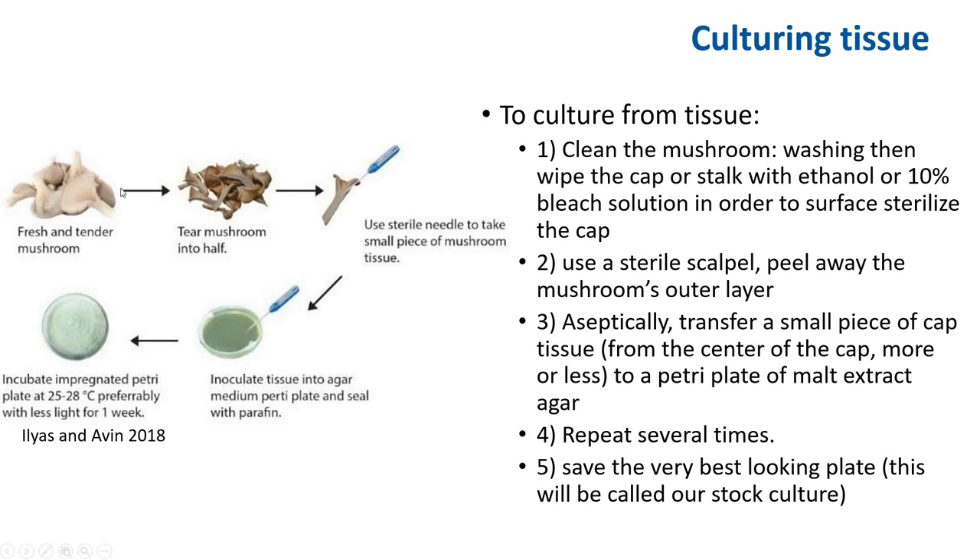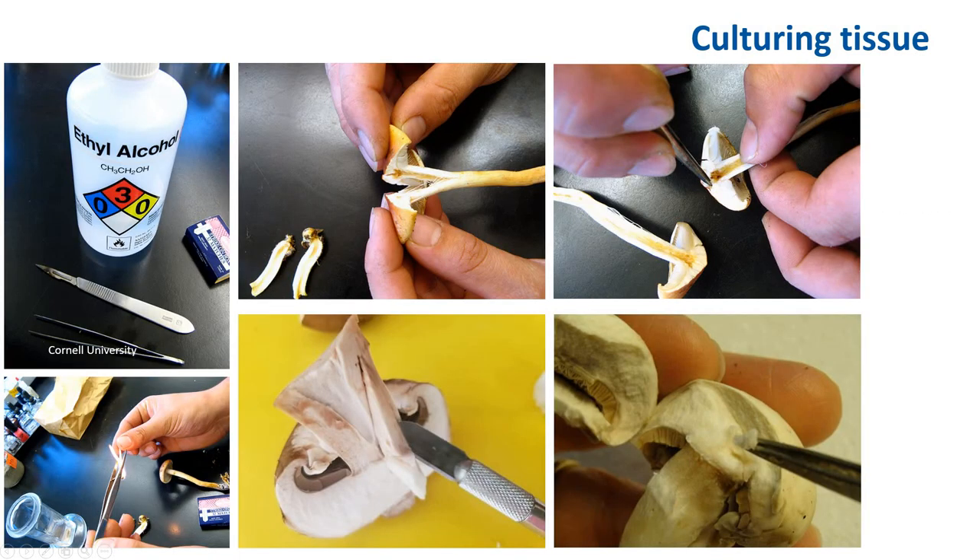Take a fresh mushroom, tear the mushroom in half and use a sterile needle. Take a small piece of tissue, transfer it to agar and wait for it to grow. To reiterate with more pictures: first, clean your hands, then clean the mushroom, then flame-sterilize your tweezers and scalpel. You can either pull your mushroom cap apart, and using clean tweezers extract a piece from the cap and put it into agar, or you can use a flame-sterilized scalpel to cut and remove a piece with tweezers. Make sure to flame-sterilize between cuttings.